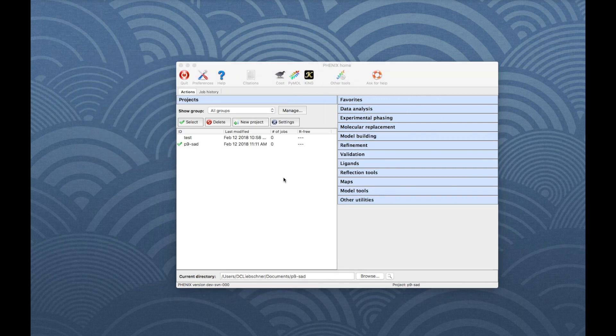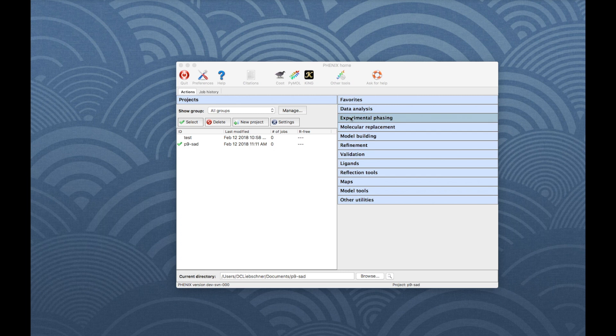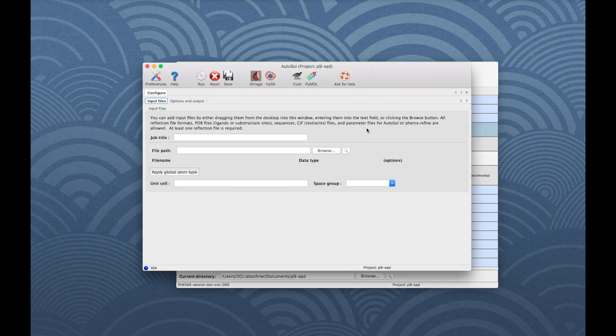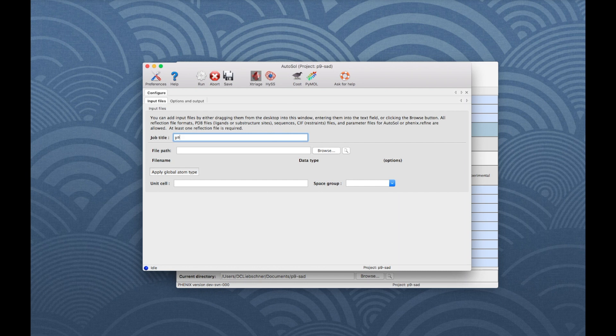To start the program, go to the right panel and click on Experimental Phasing. Then click on AutoSol and a new window opens. For bookkeeping, add a job title.